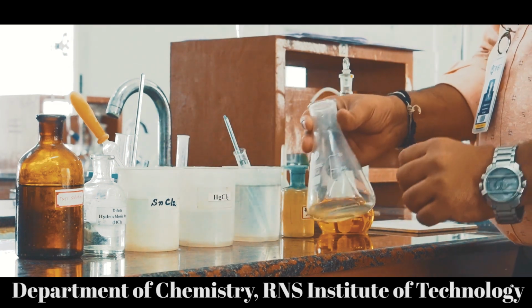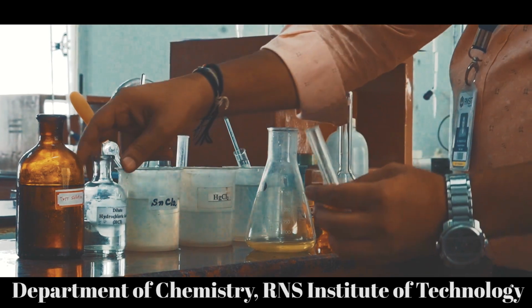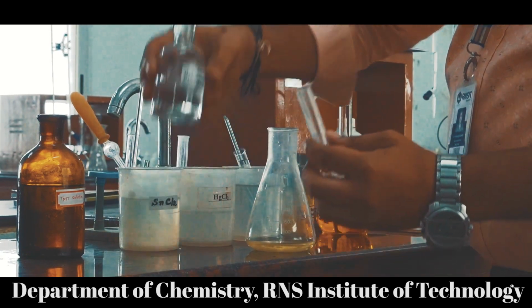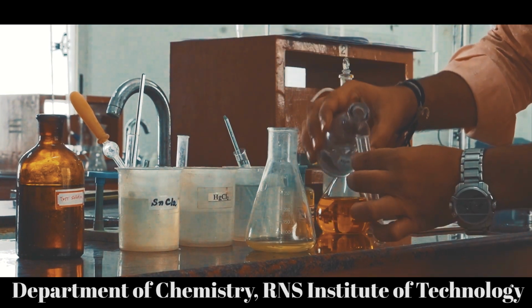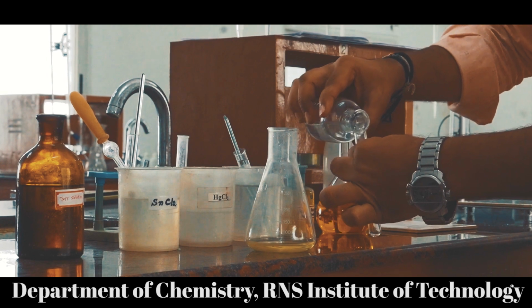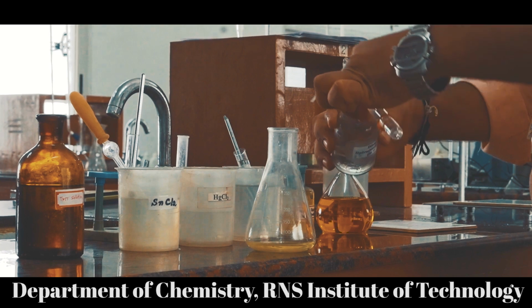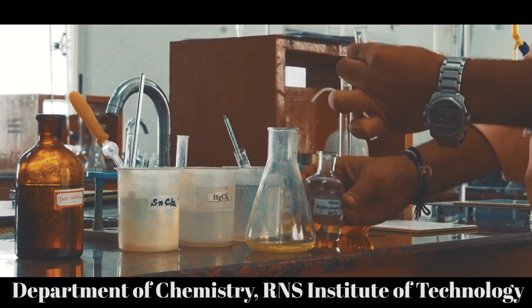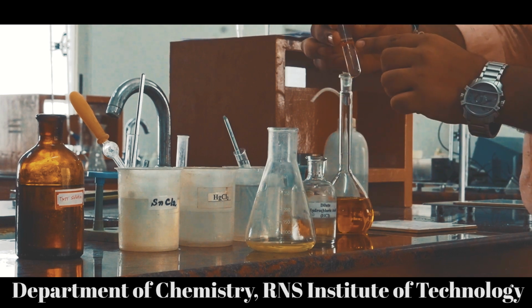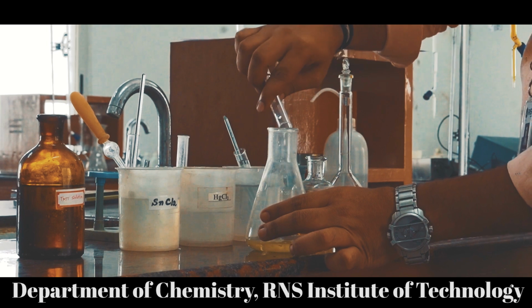So to this, what I need to add? We need to add 1/3 test tube of dilute HCl in order to digest this TMT bar solution. So I will add 1/3 test tube of HCl. Very carefully I will add because it is acid. Take exactly 1/3 test tube. It is up to this rubber mark you have to take. Then you need to add it to the solution.